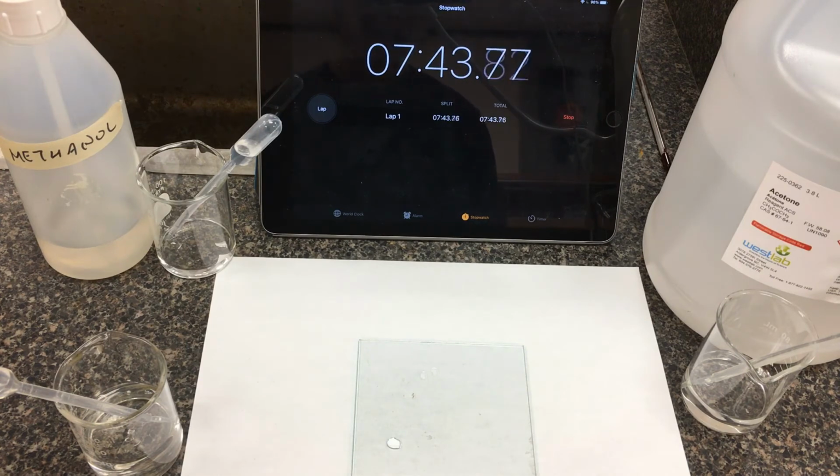So I'd say at this point, most of the methanol is gone. Yes, there are the two smallest droplets here. This is experimental error, so you can talk about why it is that there's still a little bit of residual left over. But again, essentially no change has happened to this water droplet. Just leave it for another minute or so, to see if there's any other dramatic difference between these times.